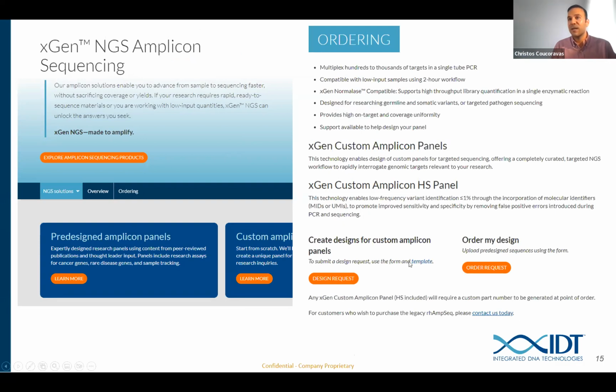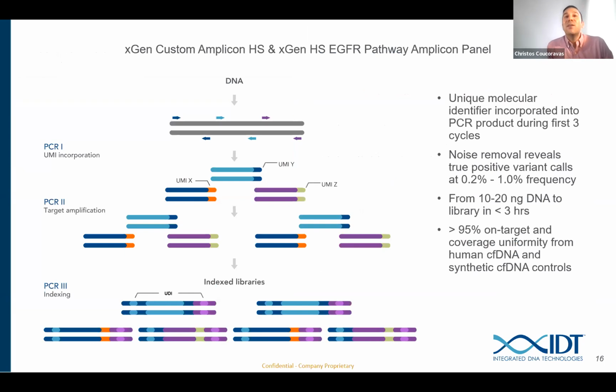Here, that's exactly what I showed you now. And also this order my design option is if you have already a design that you designed previously, you can go there, you can give the design ID, and you can proceed with the sequencing of your panel, with the ordering of your panel.